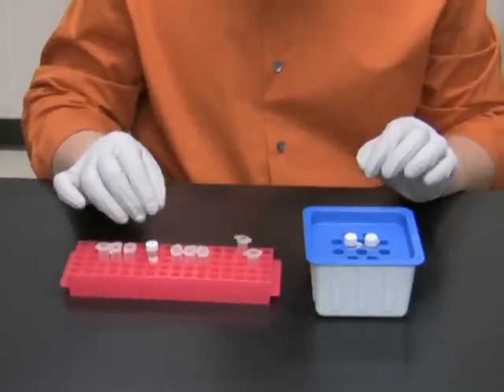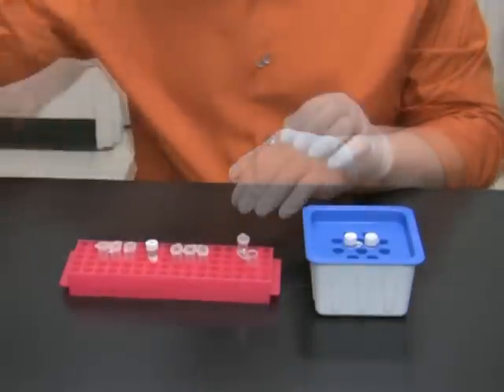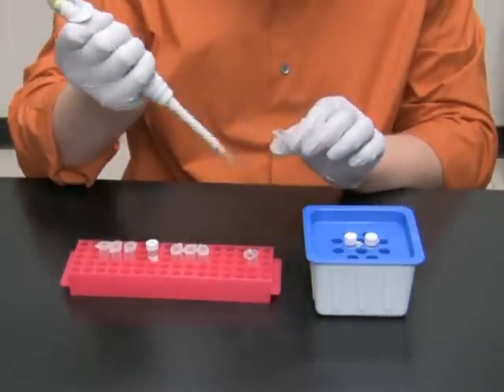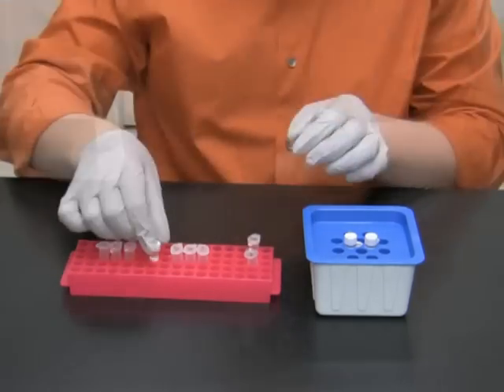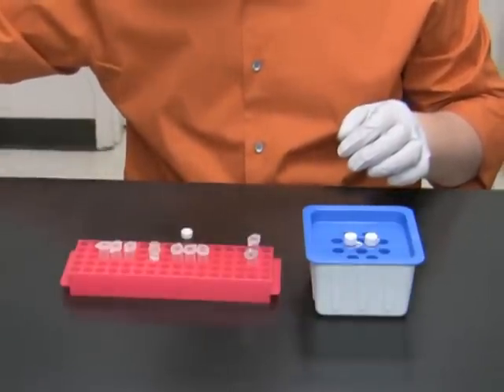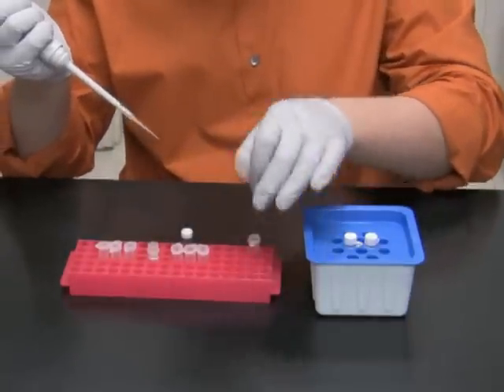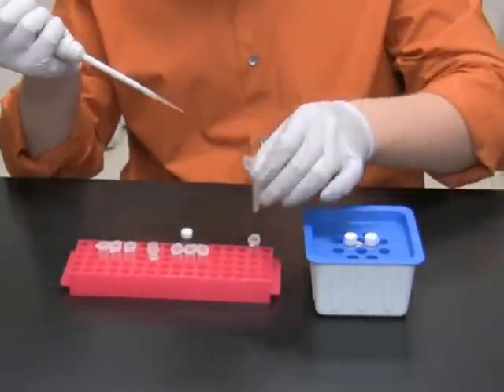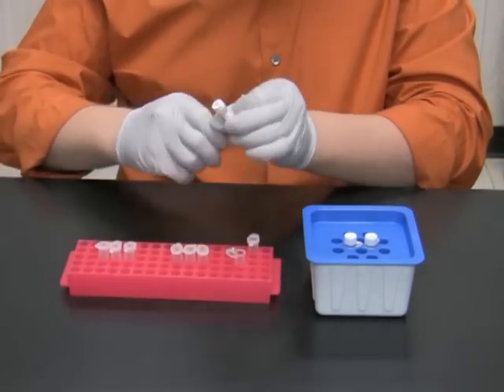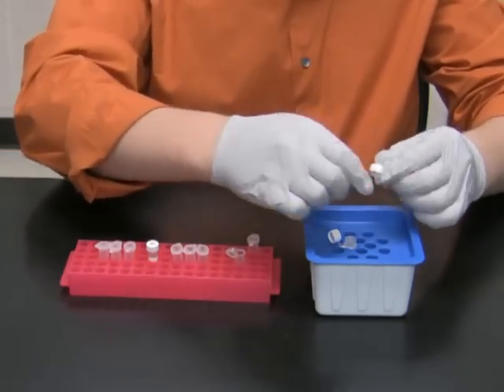In order to avoid extra pipetting, I'm going to prepare a master mix and then split it into 3 aliquots, one for each of the plasmids. In the master mix, I'm going to put 3 times the amount of all the reagents, which is 49.5 microliters of water, 6 microliters of NEB Buffer 3, 0.75 microliters of XhoI and 0.75 microliters of BamHI.